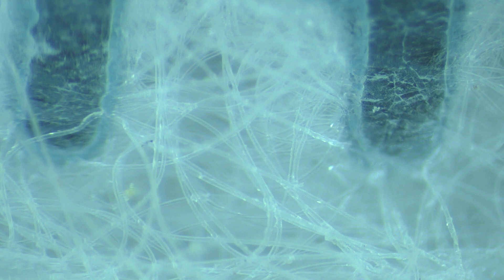So obviously when you look at the mask under the microscope you can see a bunch of holes there but they're obviously microscopic holes. A bunch of dust and stuff like this is trapped there. It almost looks like those threads have like water drops on them, but these are not water drops for sure.